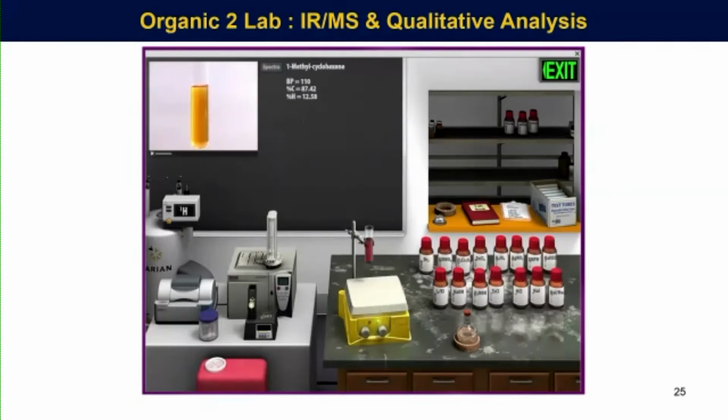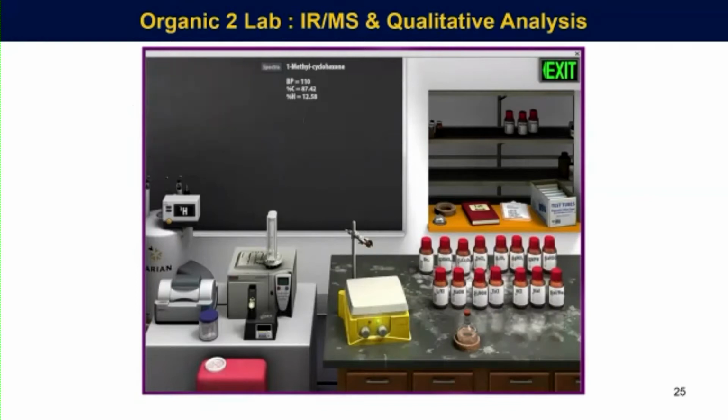And the actual visualization of this was brilliant. The fact that it disappears, the fact that the color dissipates over a few minutes here is brilliant, because then they can see it happen. Instead of just being told it's happening or reading about it, they see it happen. And that was great, because now all of a sudden they have a positive test for an alkene. And if they throw this together, maybe with the same alkene, maybe they put some HCl in, or they put some sodium hydroxide in, it doesn't mix because they're not compatible. They can see this, right? They have something to grab a hold of. So that was great, and they really started to enjoy that.